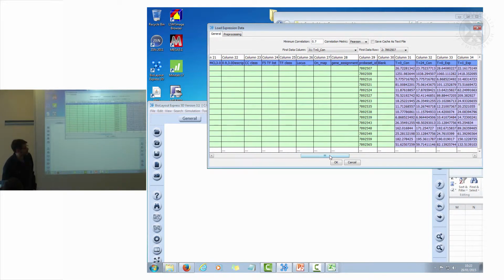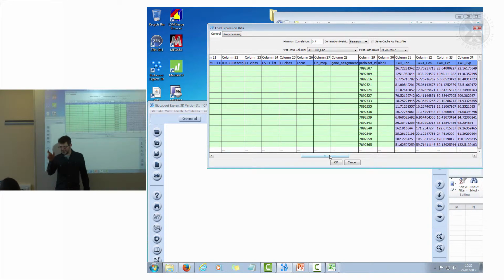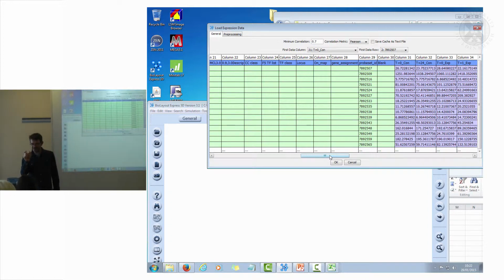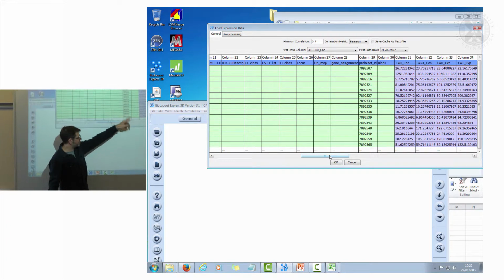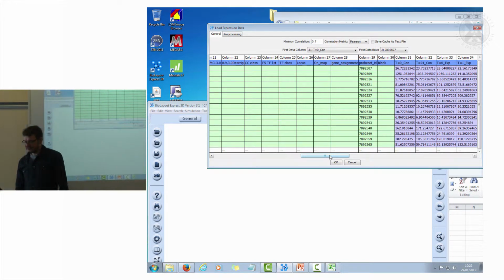The other thing to watch is, if you have a numerical value in your last column, you see how it's colored things green, red and blue. The reason it does that is that it's looking for the first set of numerical data. Now in this case this Affymetrix probe IDs is just a number, it doesn't have the underscore AT, and so that would be recognized as a value if it wasn't that.